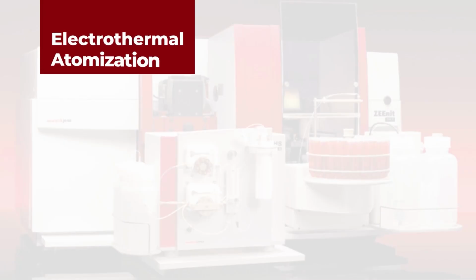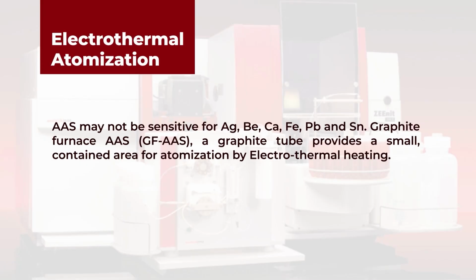So, for that, what is generally done is that the graphite furnace is used. It's basically a graphite tube which provides a small contained area for atomization. And atomization is done by electrothermal heating. It's not done by gas heating, okay. It's not air, it is not different gases burning, it is electrothermal heating.